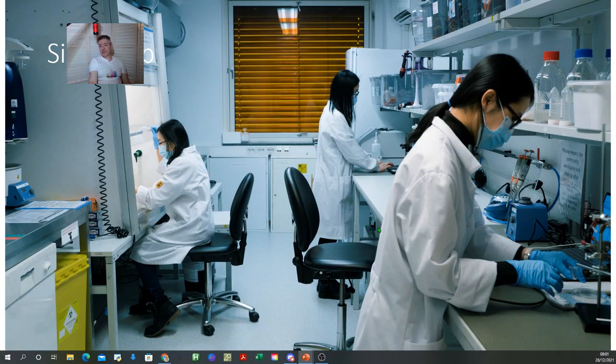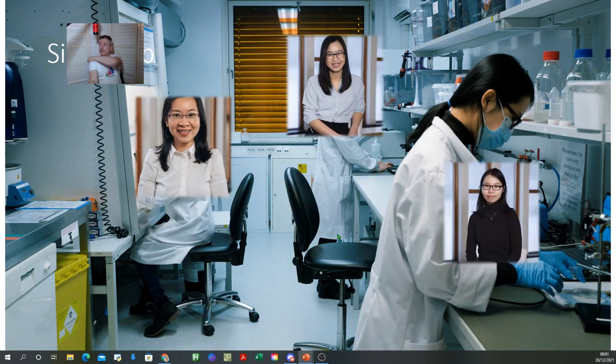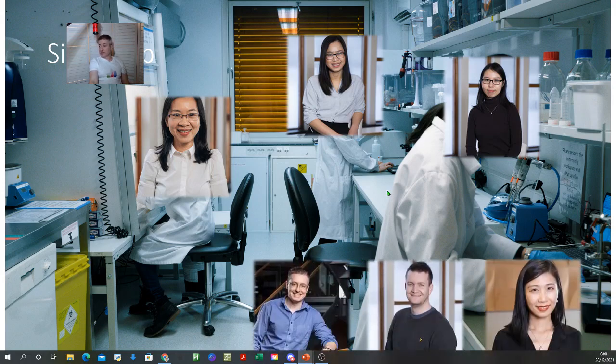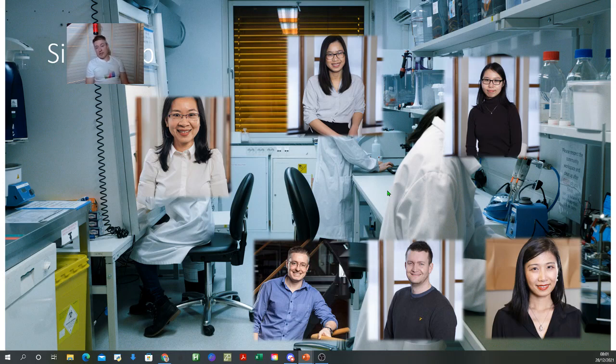So if you look at a single lab, you could have 3 scientists in that lab, and unless there is a structure in place like djuli, they can be on the same project, but actually find it very hard to share each other's data and look at each other's data without going to ask one another. And then you could have just as many stakeholders, like the CEO, the CSO, the principal investigator.